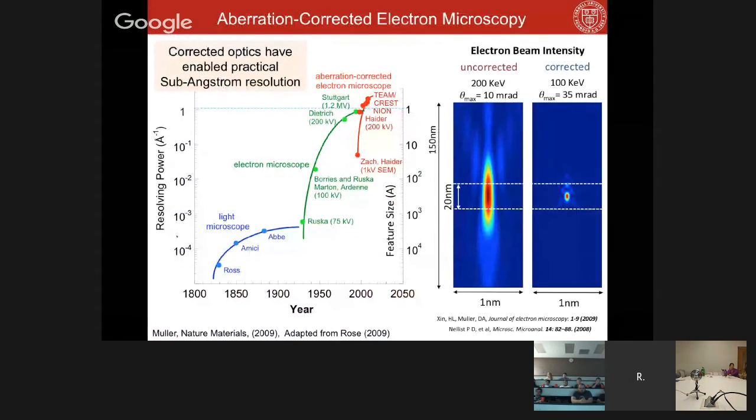Yes. Right. So what I'm showing on the right side is actually the wave function squared. So it's the intensity, the square of the wave function, but it's across depth. The vertical direction is each line is the wave function, and then the next line is what the wave function looks like after it's propagated a little bit. So the entire thing is the electron propagating across 150 nanometers. A 2D slice, or a line if you draw one of these dashed lines, that profile plot would be what the wave function intensity looks like there.